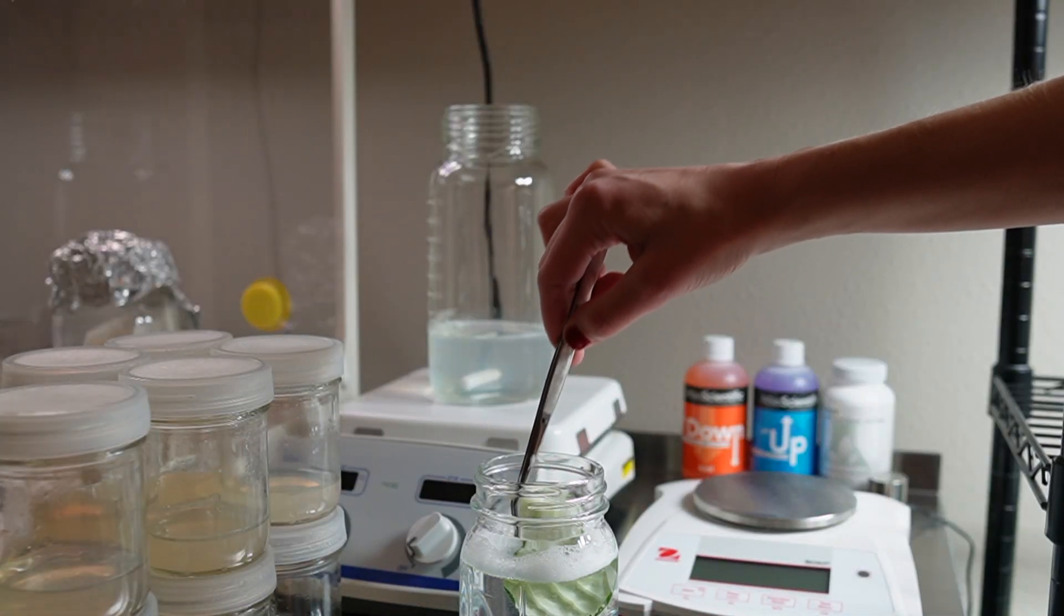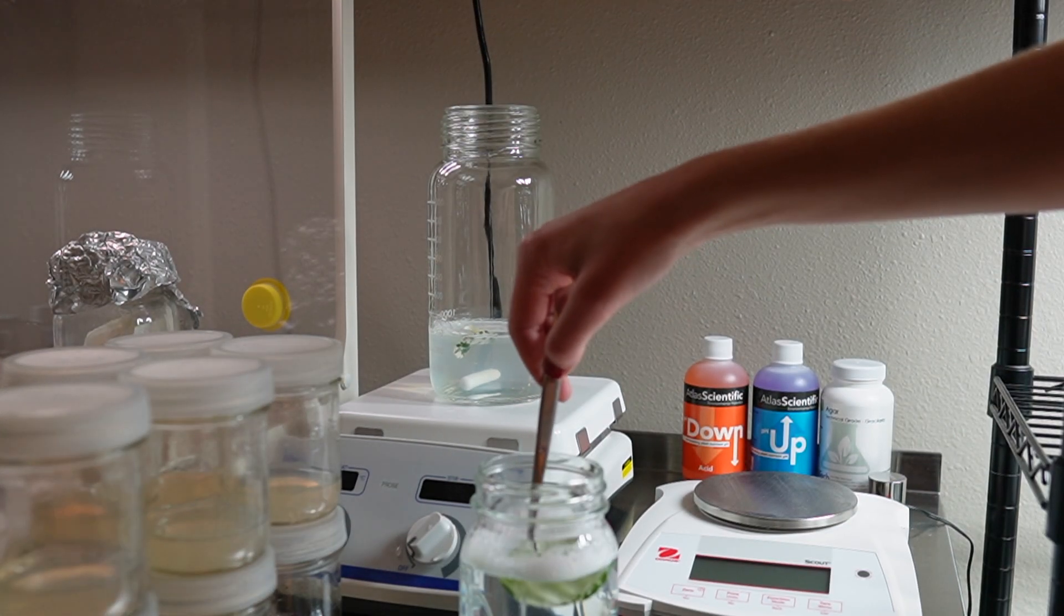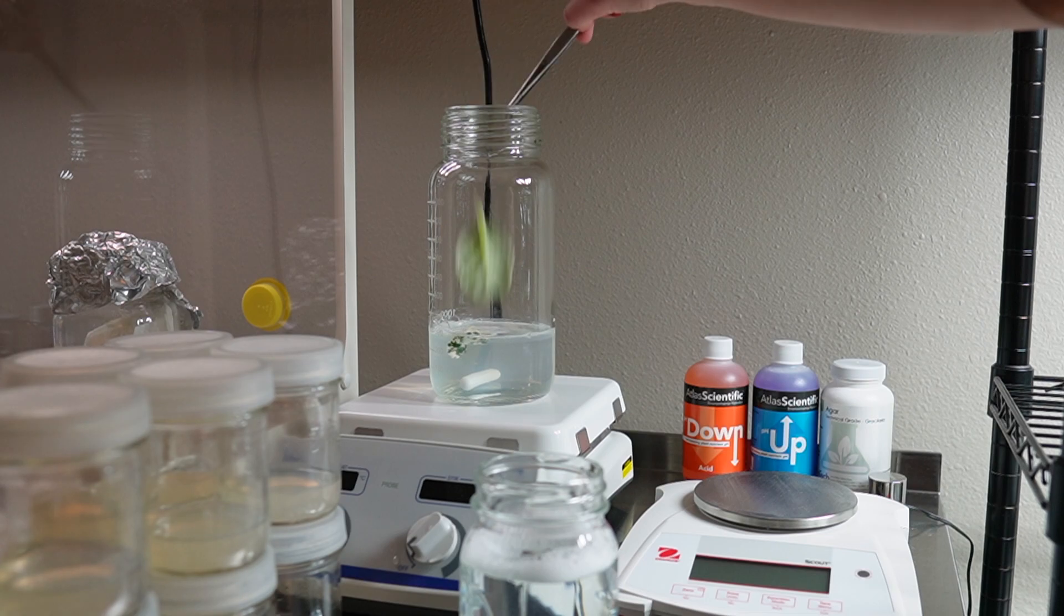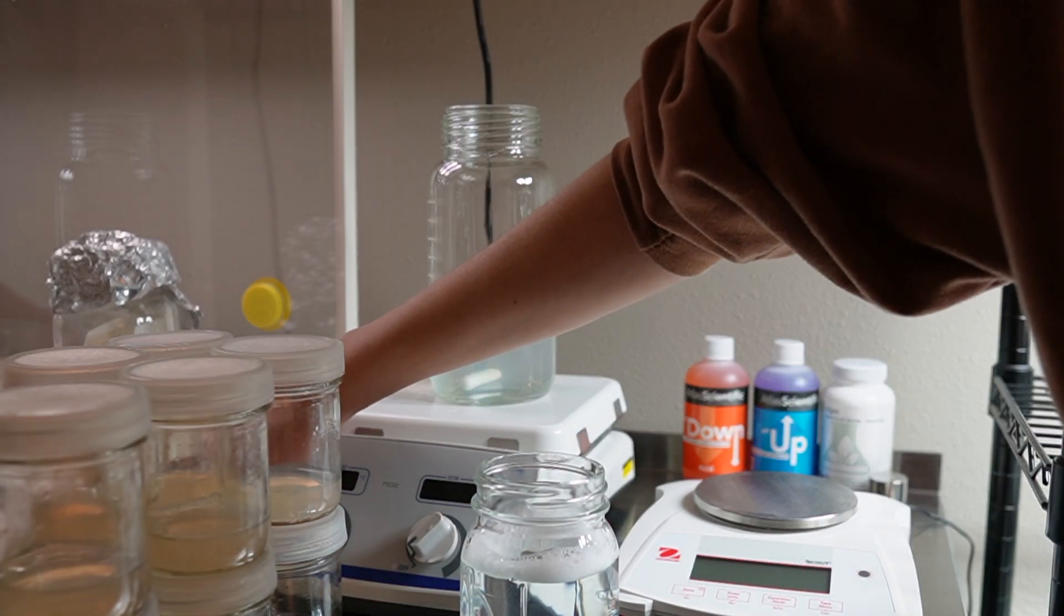You'll see that I'm using a magnetic stirrer to agitate the African violet leaves in the bleach solution. If you don't have one of these, you can just do this by hand. It works exactly the same.